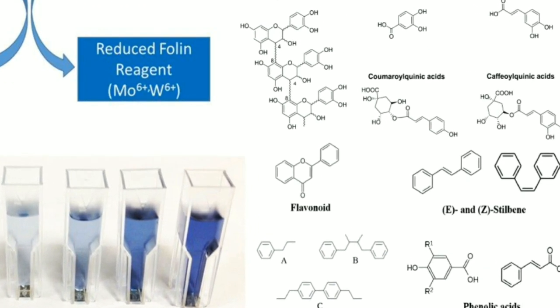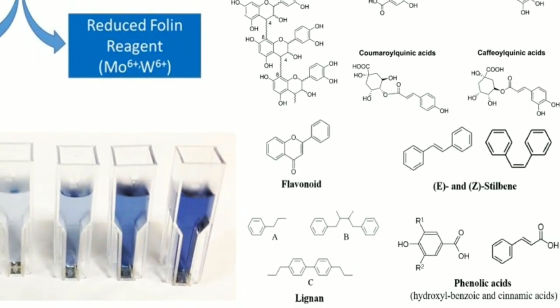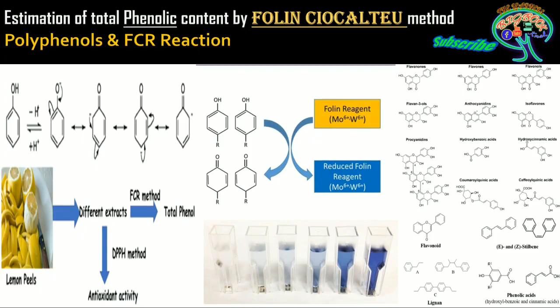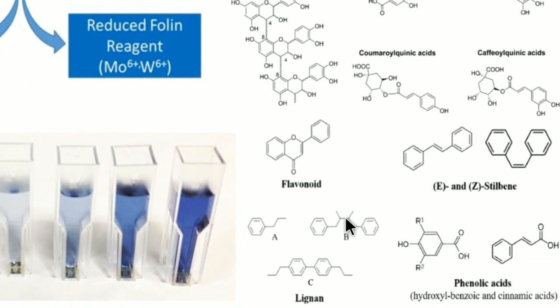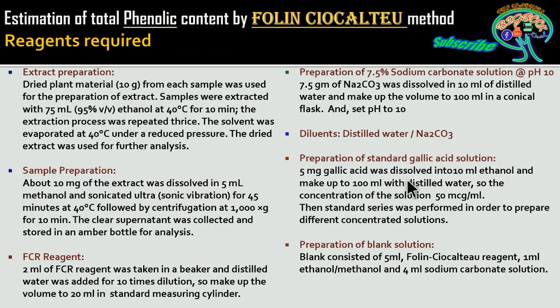Now here you can see these are the polyphenolic or phenolic components, which we have already seen in the previous slides. Here also it is the same, with a few extra structures. After this slide we will discuss the reagent.